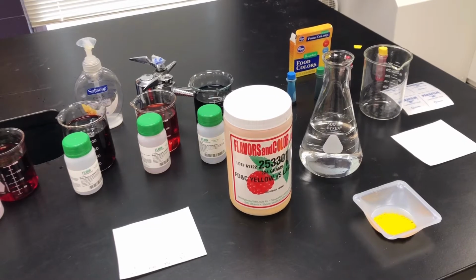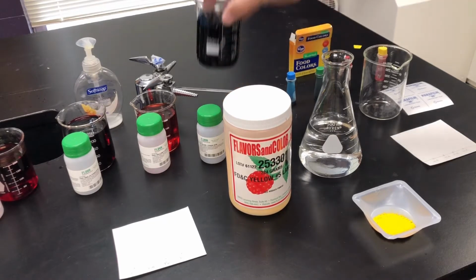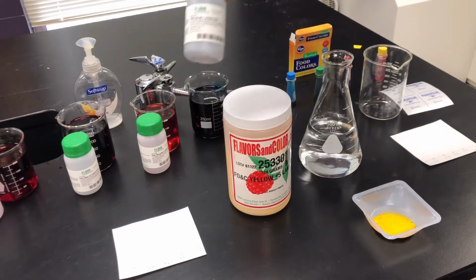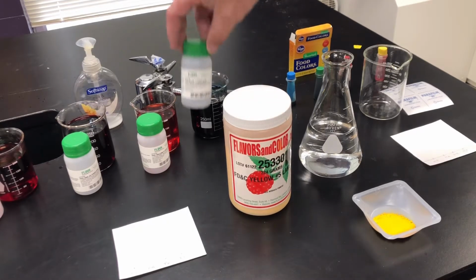So before we get started, what I want to do is show you a little bit about how we mix some of this up, some of the lab techniques that you won't get to do here in lab, but I want you to see it. So here we have a 0.5% by mass solution of FD&C blue number 1 food dye.